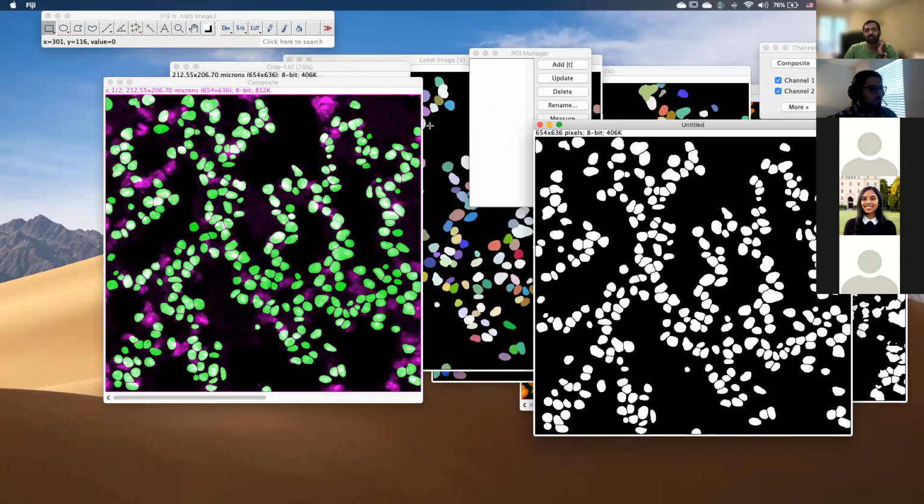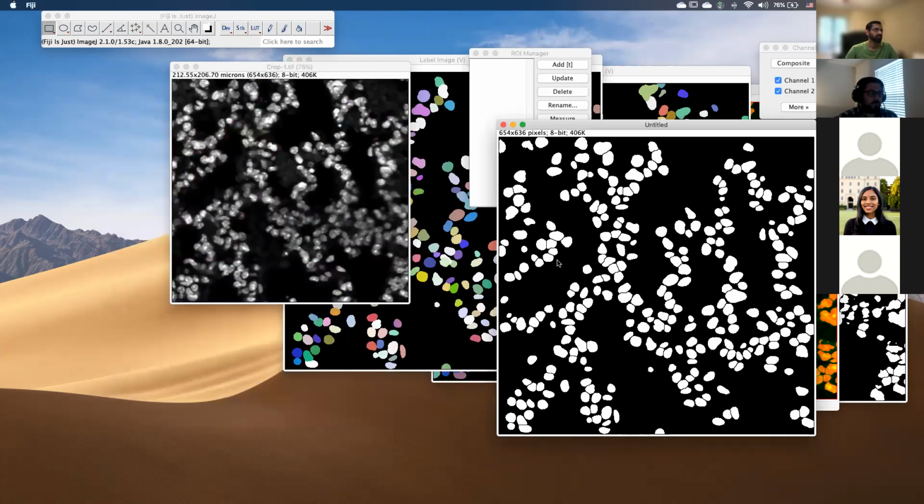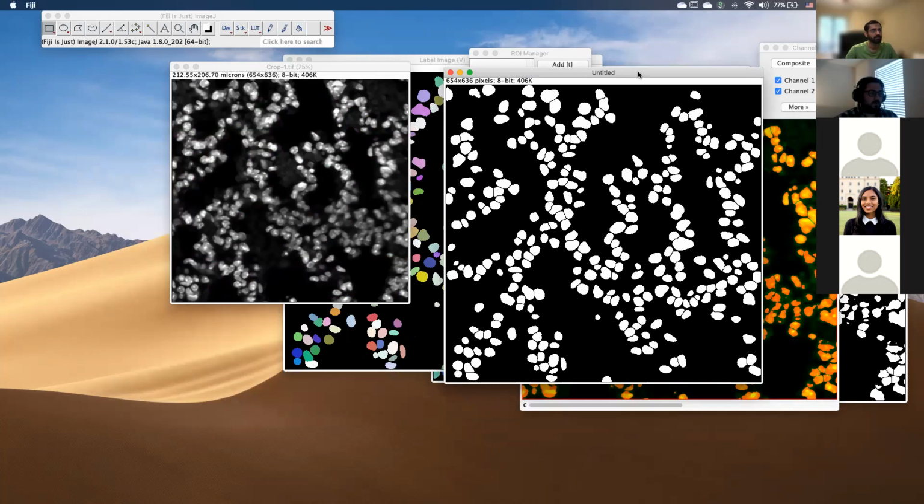Okay, let's see. But I'll produce this new image first, right? Right. And if you want, I can let you share the screen so that you can show if that's a problem. Let me see if... yeah, no, it's still complaining. Okay, can I? Let me share the screen. Yeah, please.